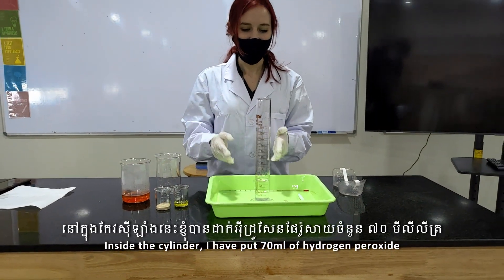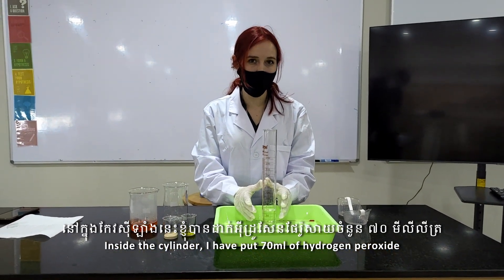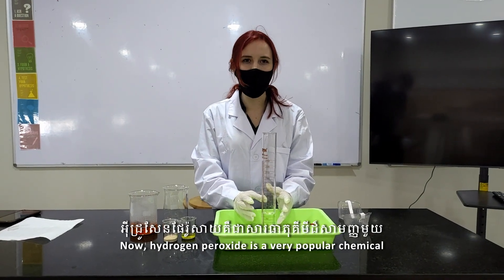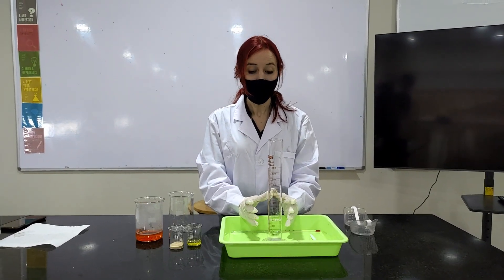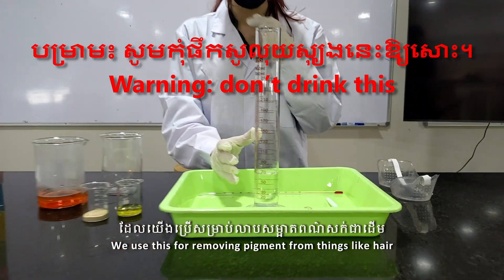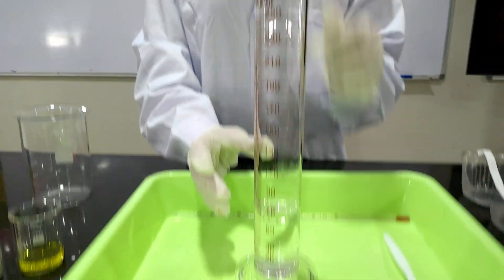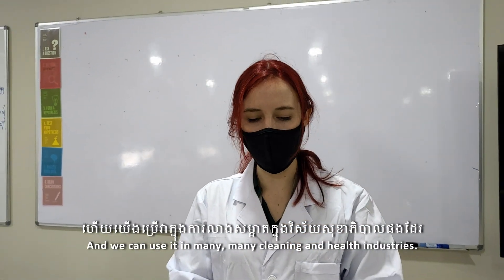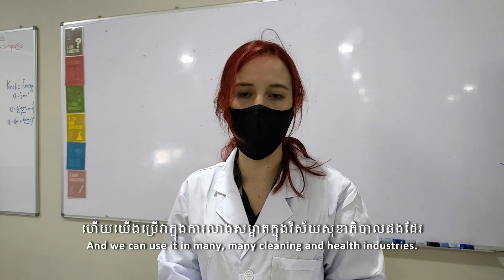Inside the cylinder I put 70 ml of hydrogen peroxide. Hydrogen peroxide is a very popular chemical. We use this for removing pigment from things like hair.